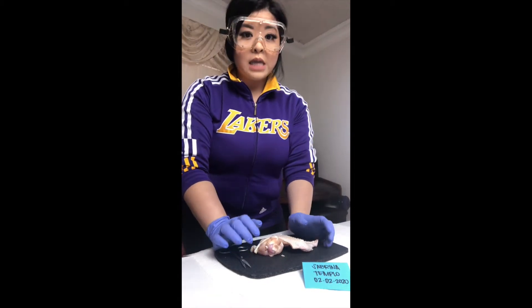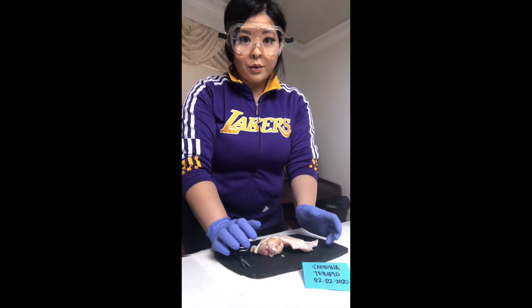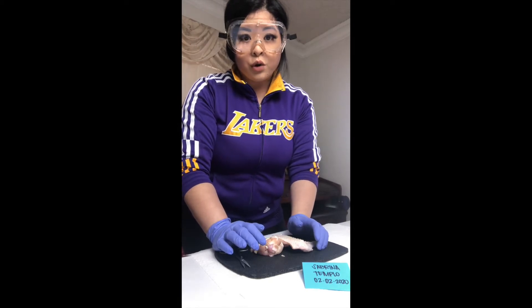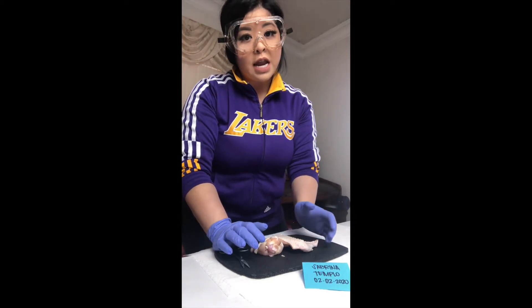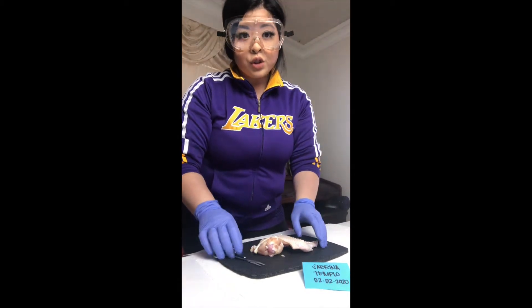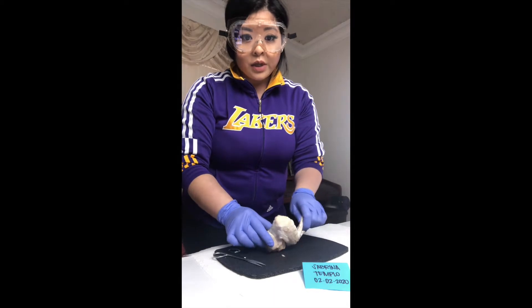Hello, my name is Sabrina Templo. Today is February 2nd, 2020, and this video is for Biology 230 Anatomy Physiology for Week 3, and this is for joints, and we're going to be dissecting a chicken wing.